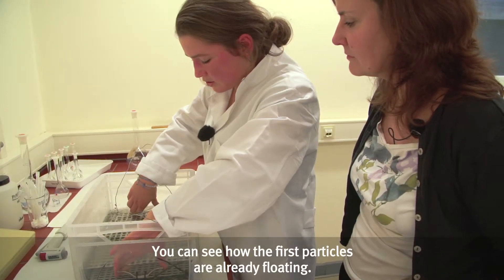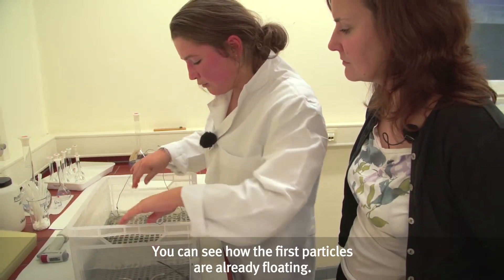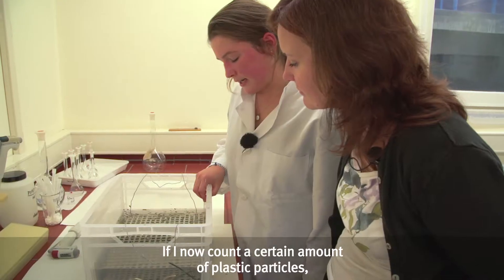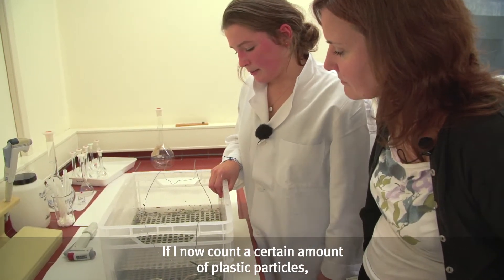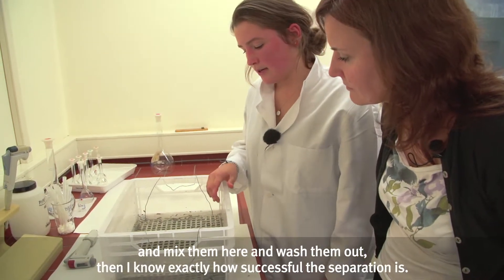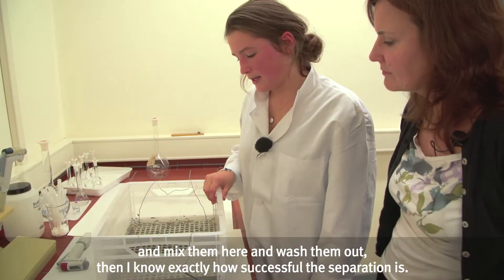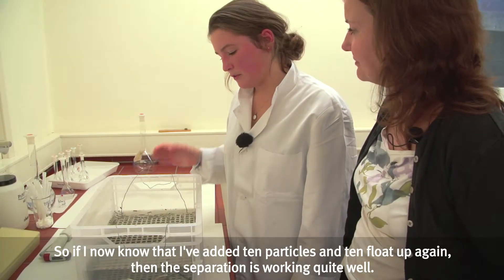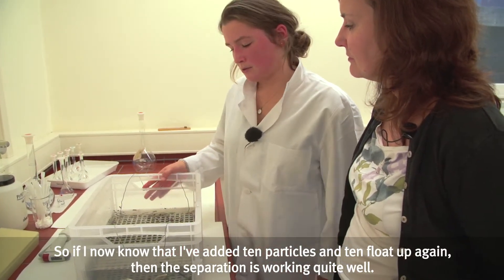You can already clearly see that the first particles are floating up. I added them myself — because if I count a certain number of plastic particles, mix them in, and then wash them out, I know exactly what the separation success rate is. So if I mixed in ten particles and ten float back up, then the separation is working well.